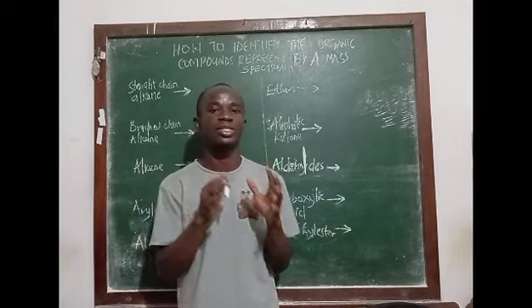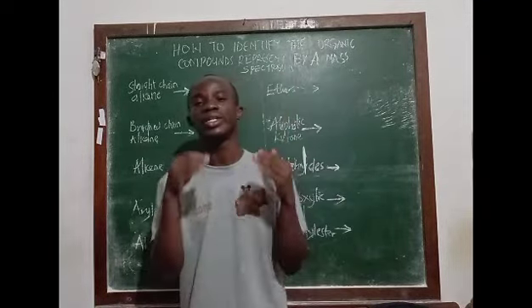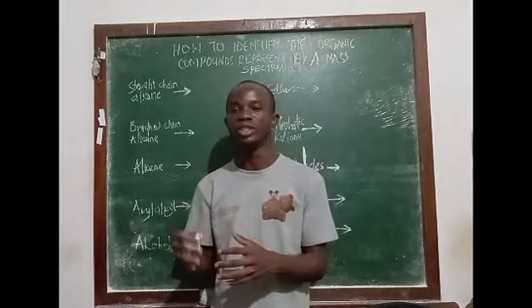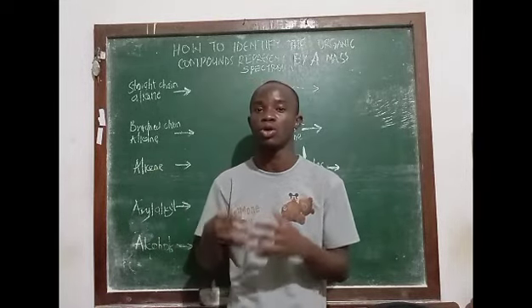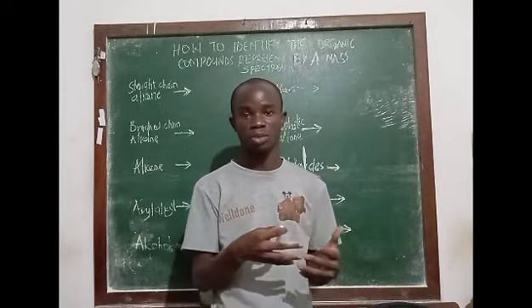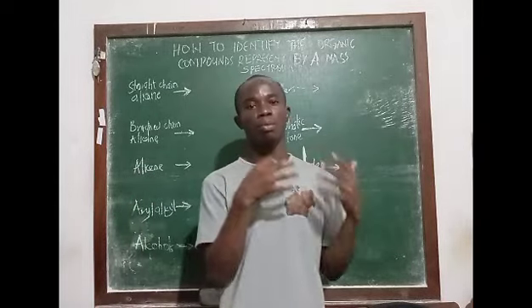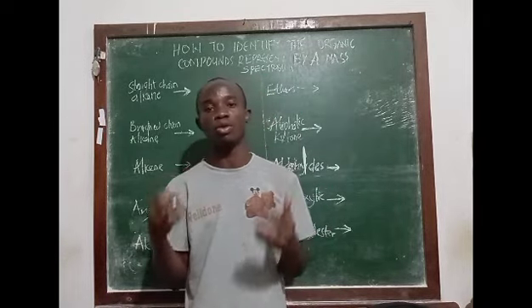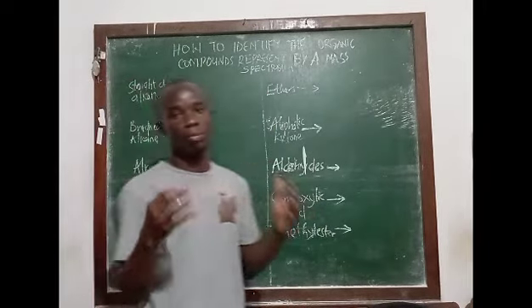So the parent peak in a mass spectrum is the signal that identifies the molecular ion, and in general, a molecular ion has the same mass to charge ratio as the molecule itself. So if I know the parent peak from a mass spectrum, I already know the molecular mass of the given molecule, which can also help me determine the molecular formula of the compound represented by the given mass spectrum.